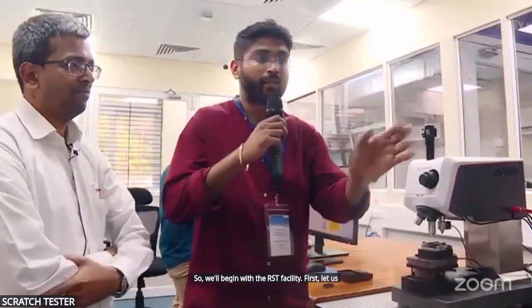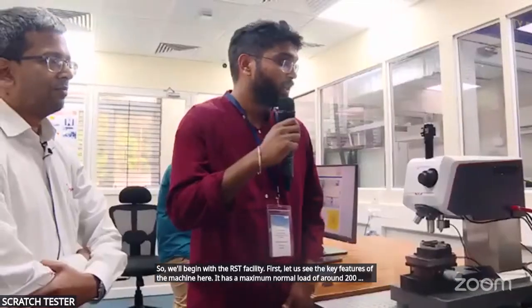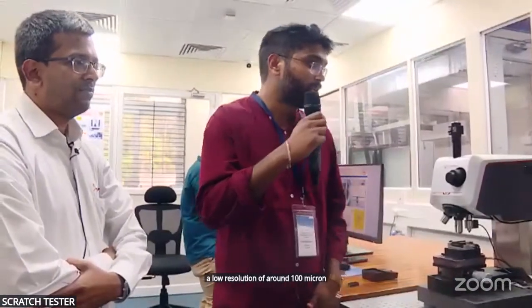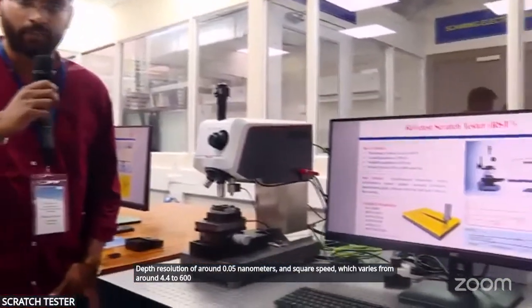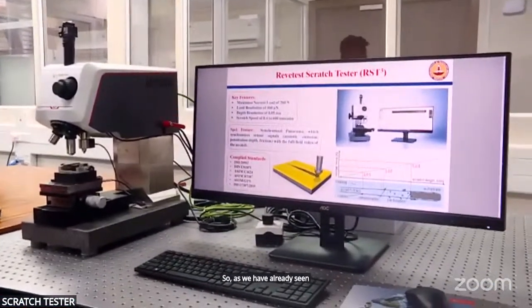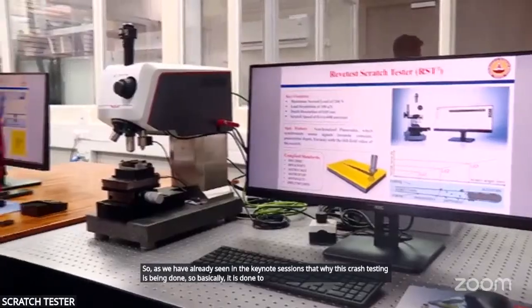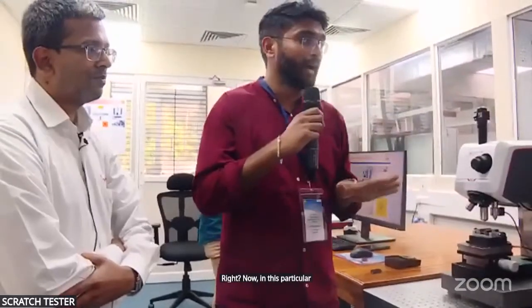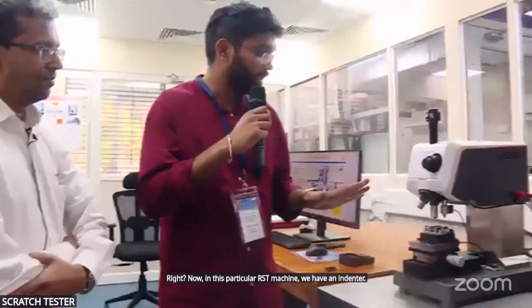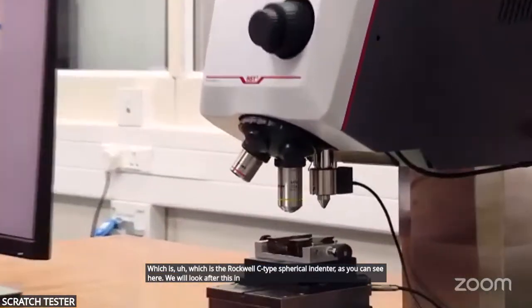First, let us see the key features of the machine here. It has a maximum normal load of around 200 newtons, load resolution of around 100 micronewtons, depth resolution of around 0.05 nanometers, and scratch speed, which varies from around 0.4 to 600 mm per minute. As we have already seen in the keynote sessions why this scratch testing is done: it is done to determine the adhesive strength of the coating, right?